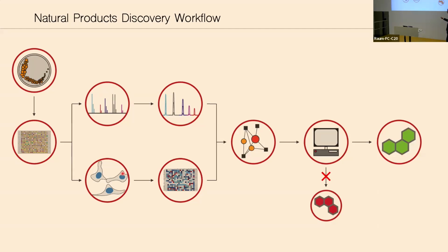Once those two pieces of data are in hand, one must then integrate those two data sets together into a single data set, which hopefully will allow you to draw connections between presence or absence of chemotypes in your data set and presence or absence of phenotypes. The long-term goal is selecting those molecules most worthy of development and eliminating aspects of rediscovery or molecules which are known to have liabilities that don't make them useful for your biological endpoint, whatever that endpoint is.